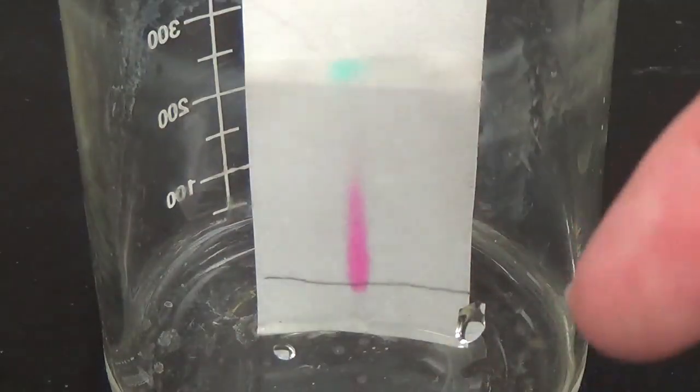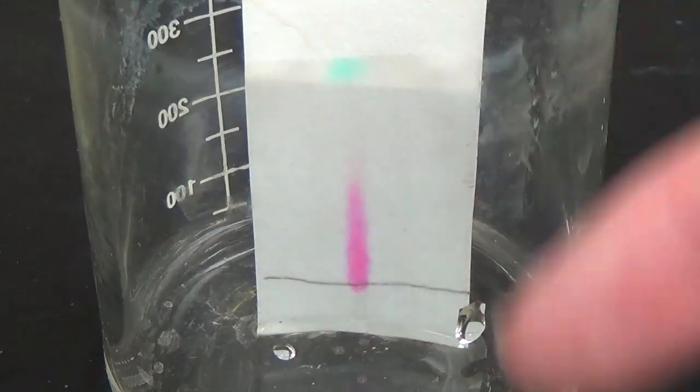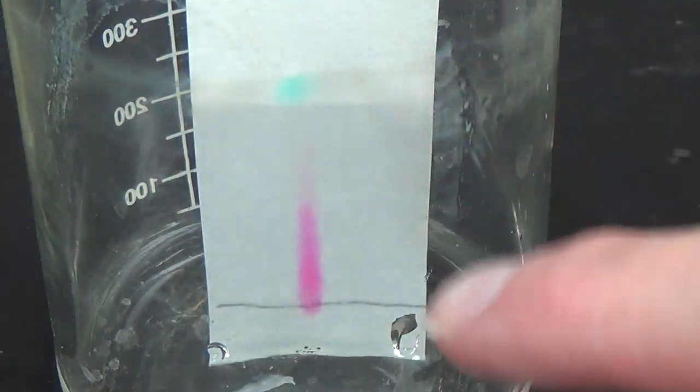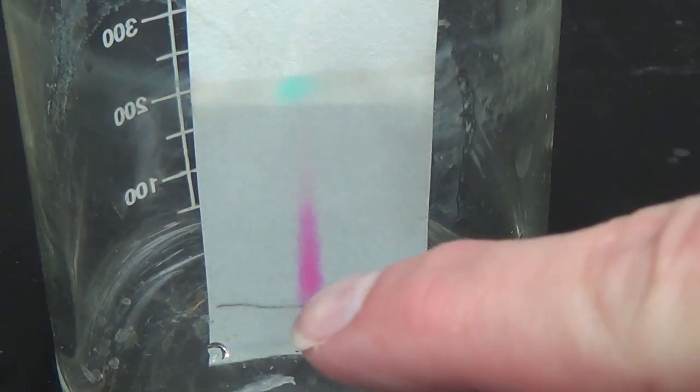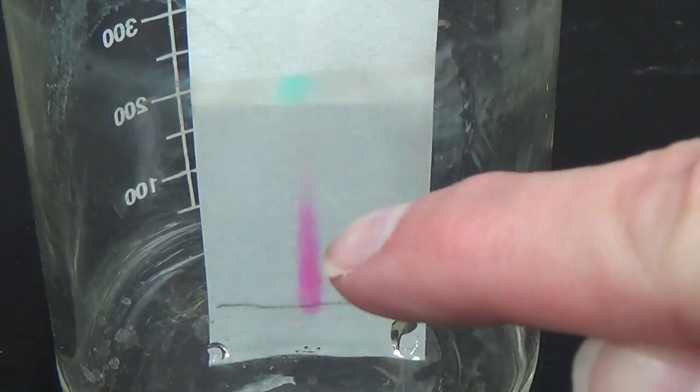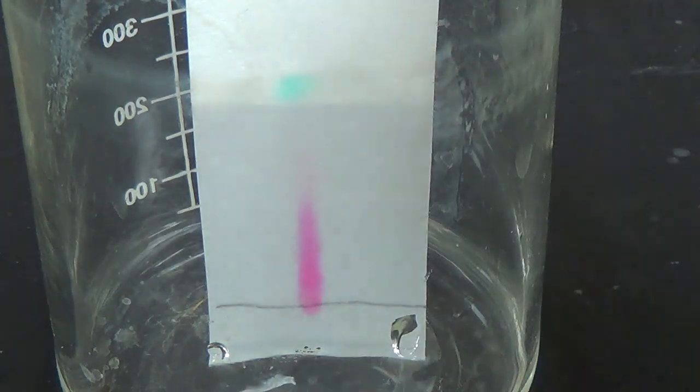Okay, so welcome back. If you were fast forwarding, hopefully you have stopped. I'm waiting to be like, hey, pay attention. Okay. As you can see, even in the short time, we got our purple to separate into blue and red. And, you know, that is not surprising. But here's how we need to finish it off.